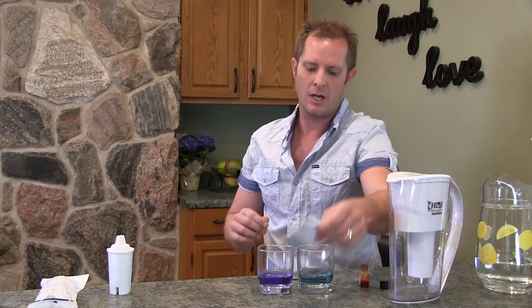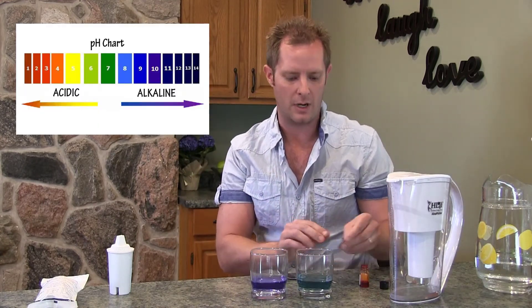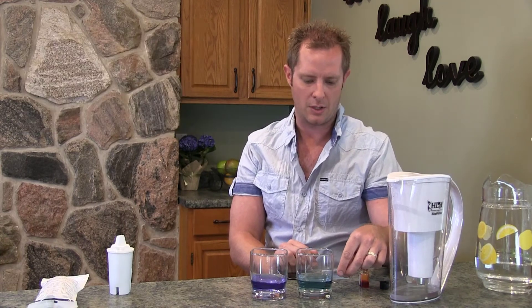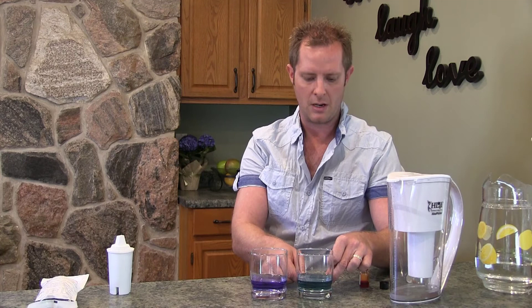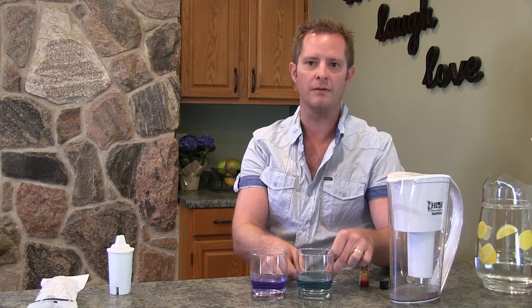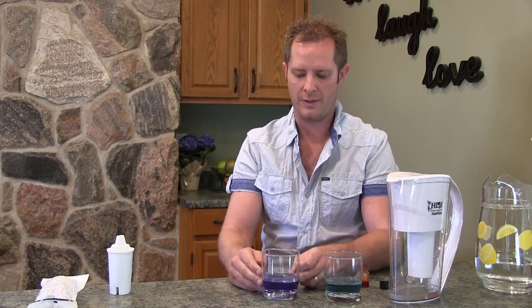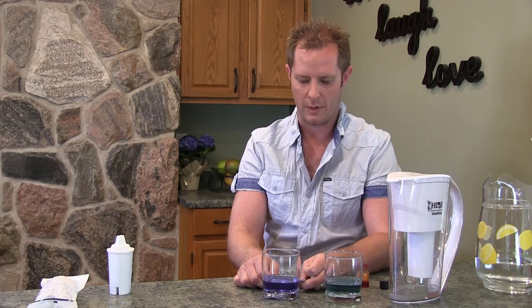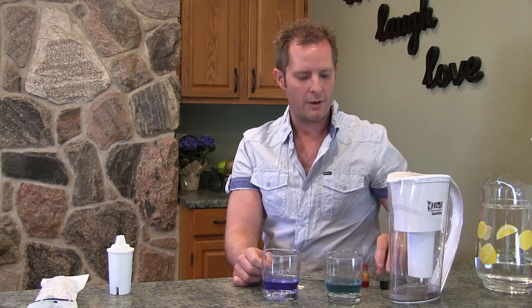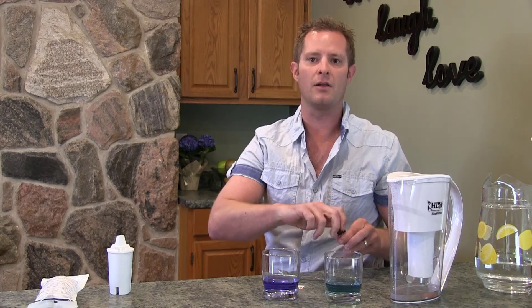If we take the pH indicator and look at the color chart, the tap water is right at about pH 7, and the Alka Pitcher water is right at about pH 9. So there you have it — a quick, easy test to see how alkaline your water is.